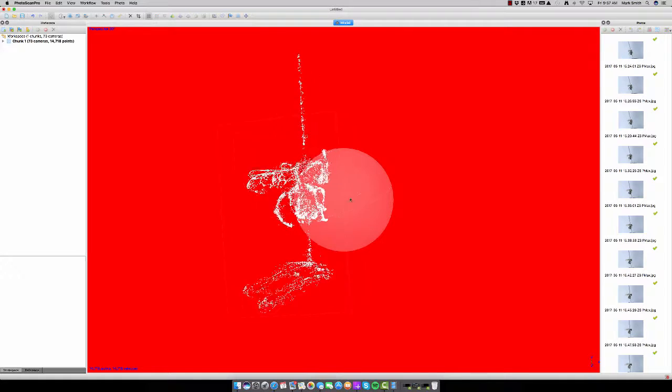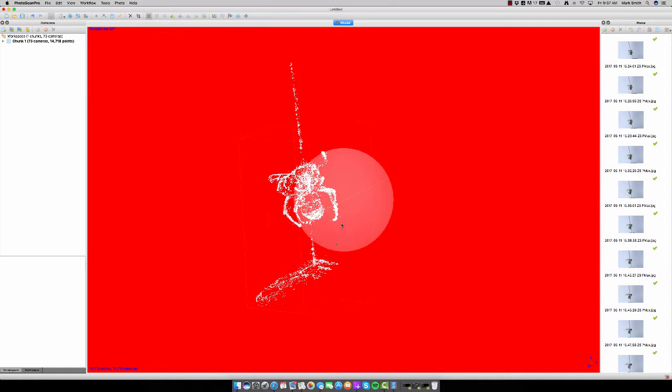You can also rotate the model. You can see that here's some added pixels that we want to eliminate. So we're just going to go back to this. I'm going to select a few, X those, and so on and so on. And we're just going to continue to do this until there are no loose pixels in space. So I'm just going to speed this up for you now.